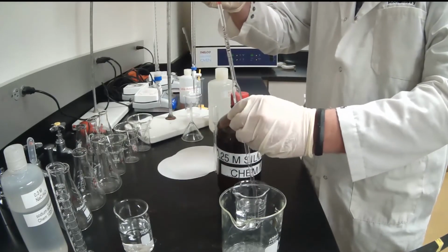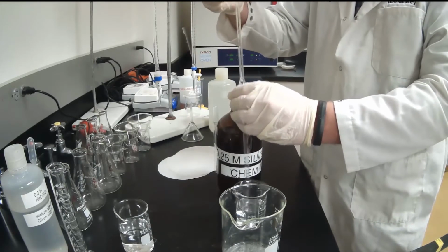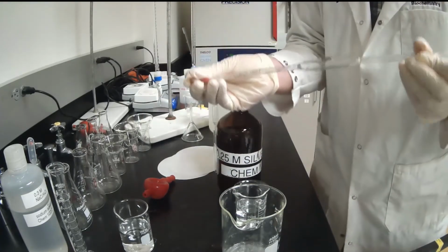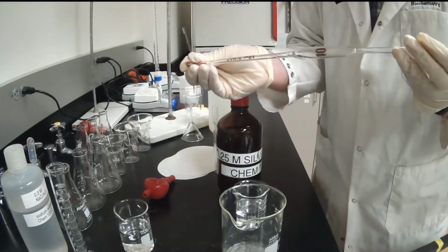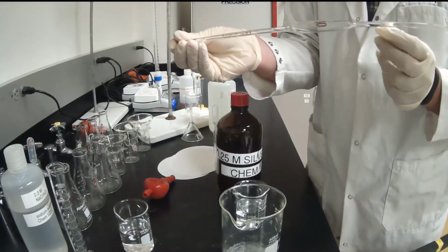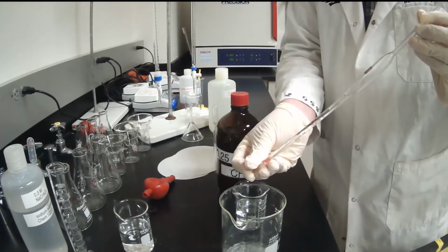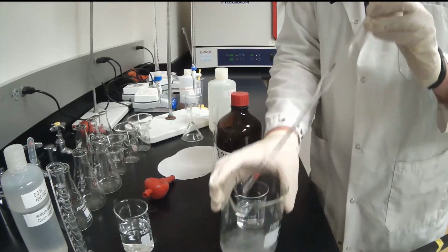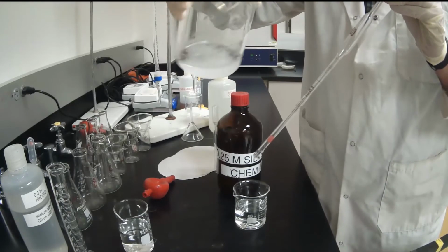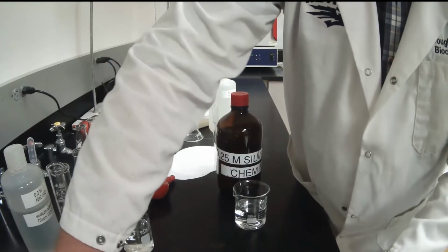Because what we're doing is we're using the material we're going to pipette to thoroughly rinse the glassware so that the only liquid that's been inside of here that it will come in contact with is itself. That way it will not react with anything until we're actually ready for it to react and cause our reaction. So you want to make sure there's no solid precipitate debris forming inside your pipette. And then I am putting it into this waste beaker where you can see, because I've already rinsed the other one, that there's some lovely precipitate. So this is what we're going to be collecting, lethal glitter. That's probably not a technical term.